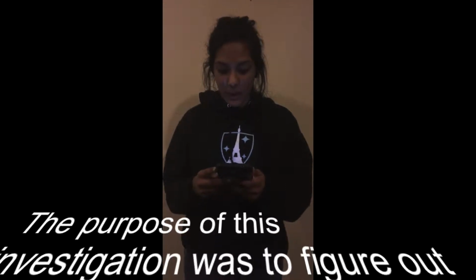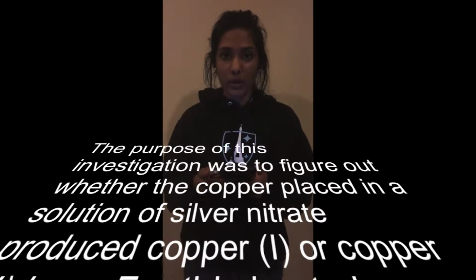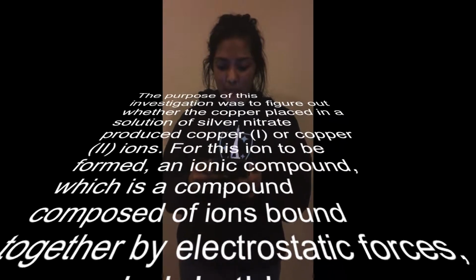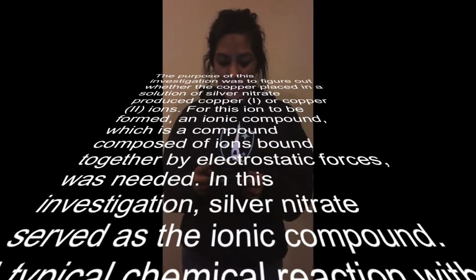The purpose of this investigation was to figure out whether the copper placed in a solution of silver nitrate produced copper 1 or copper 2 ions. For this ion to be formed, an ionic compound, which is a compound composed of ions bound together by electrostatic forces, was needed. In this investigation, silver nitrate served as the ionic compound.